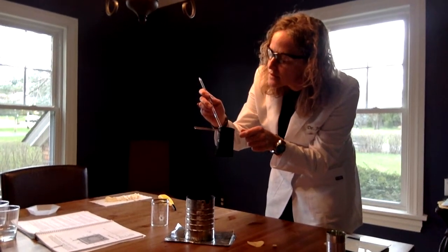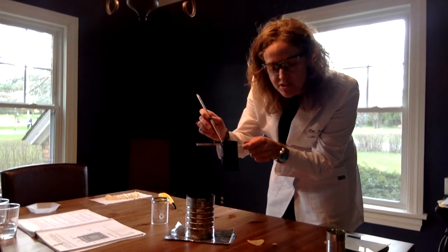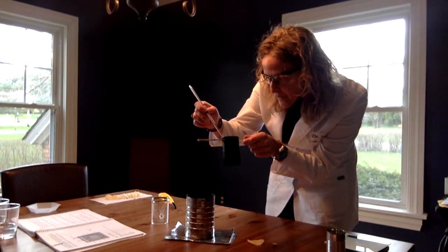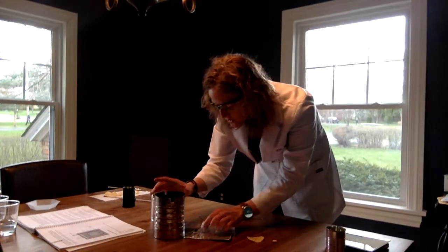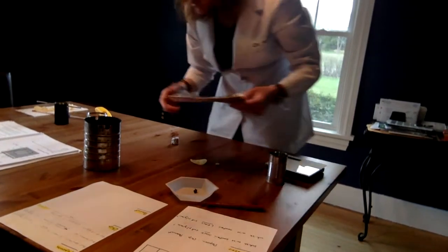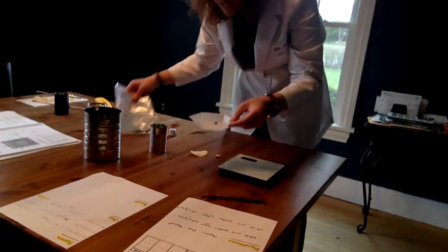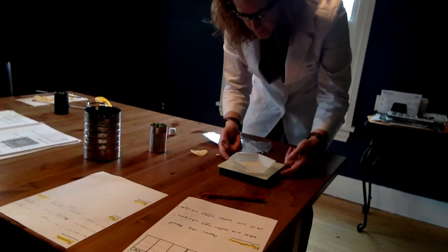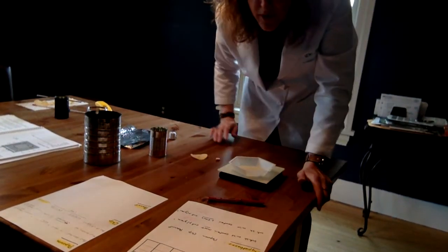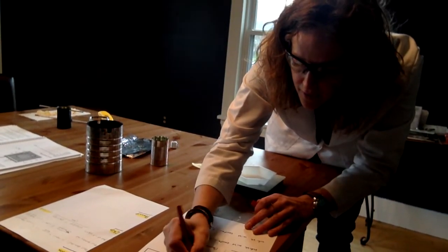It seems to have not gone up that much. Our initial temperature was 33 degrees Celsius, now it's 34 degrees Celsius. So I'm going to put in 34 degrees Celsius. If I take this off, we're going to see what's left — that's what's left of the popcorn piece. I'm going to put it back on the scale. Our initial weight was 0.22 grams, our weight now is 0.2 grams. All right.